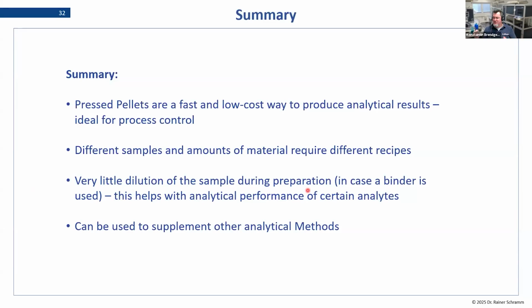In the details, you always have to try out the performance and see if it matches your expectations or specifications. And in some cases, as I mentioned with the GEO method, we actually use both, and we combine results from different analysis techniques to get the best results possible.